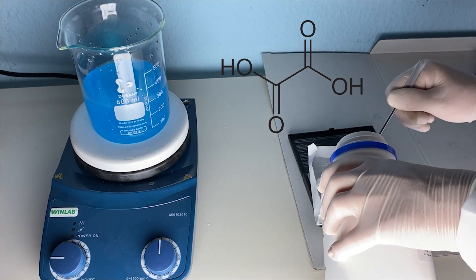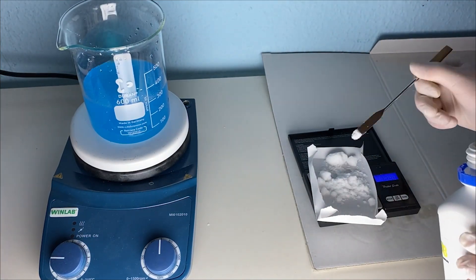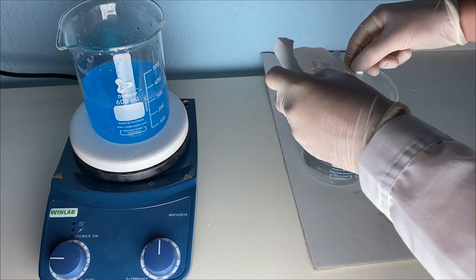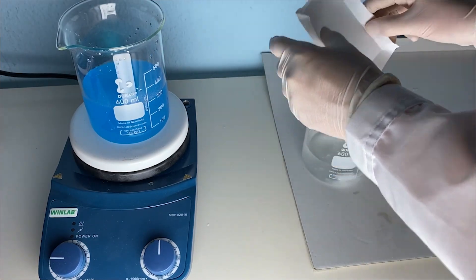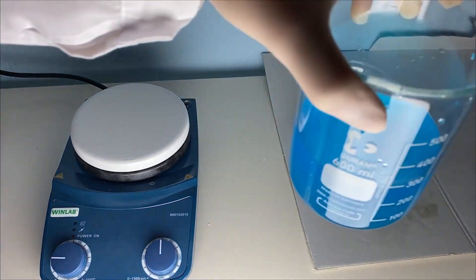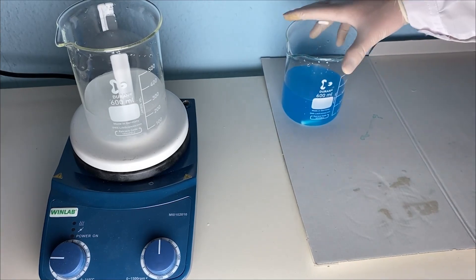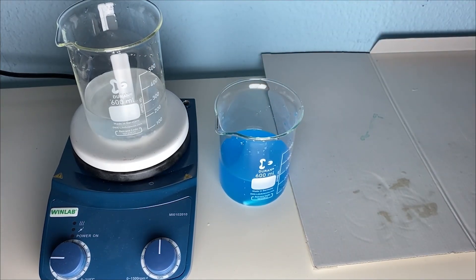Simultaneously I'm measuring out the oxalic acid, which unfortunately formed big clumps which made it harder to measure out. After that I dissolved the oxalic acid in about 200 milliliters of distilled water and then put it onto the stir plate after the copper sulfate was finished dissolving. Two minutes later the oxalic acid was finished dissolving.